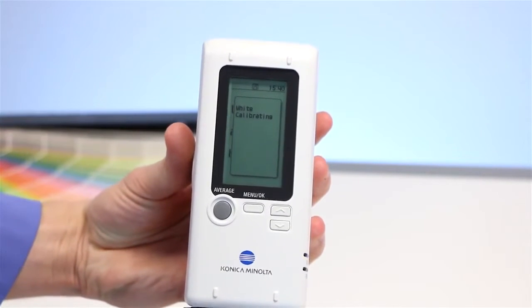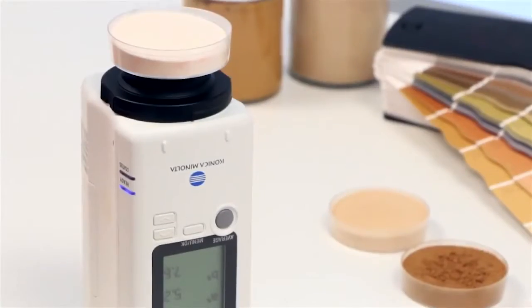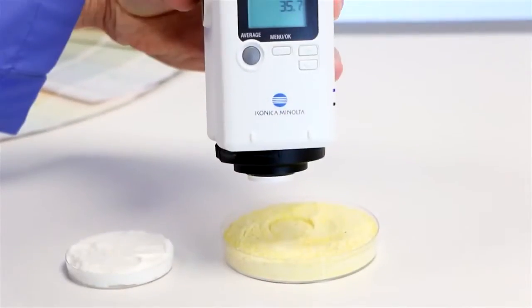All color measurements are taken in the standard Illuminant D65 with a 10 degree observer. Readings are displayed as absolute values.